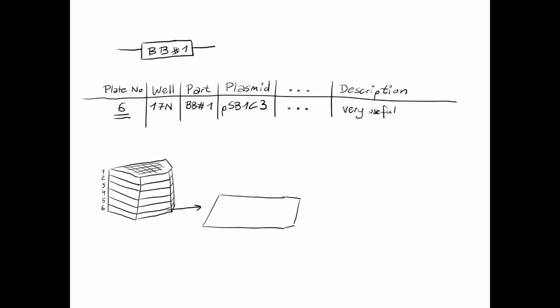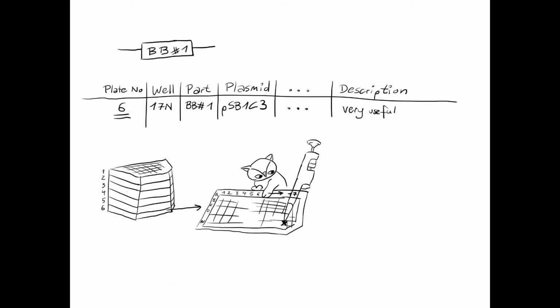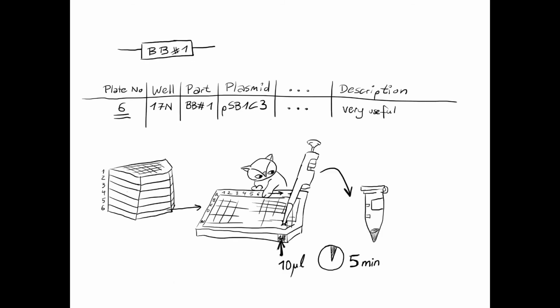When you find the correct plate, you might not be able to read the letters and numbers on the side. Just push down the aluminum foil with your thumb to make them visible. Then mark the desired location. Pipette in 10 microliters of water and let it stand for 5 minutes. There you go, your biobrick is ready for transformation.